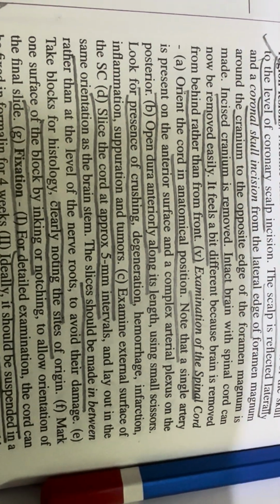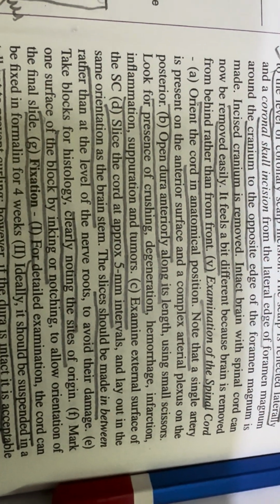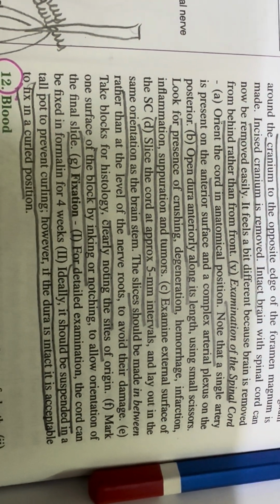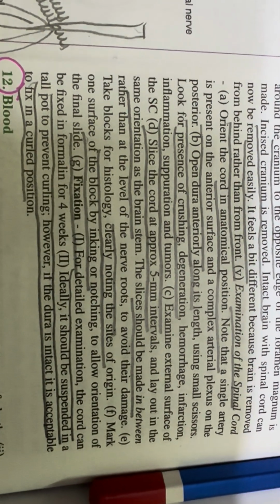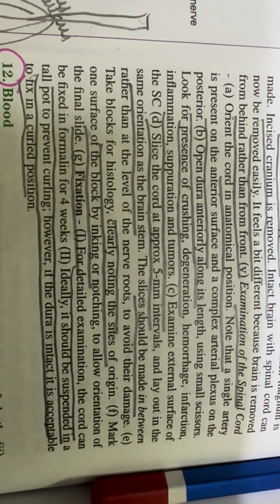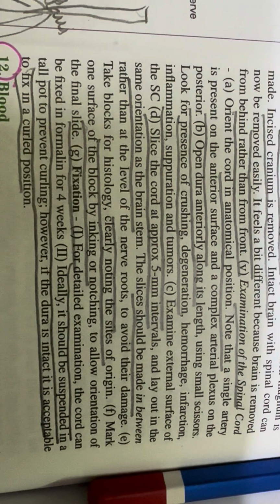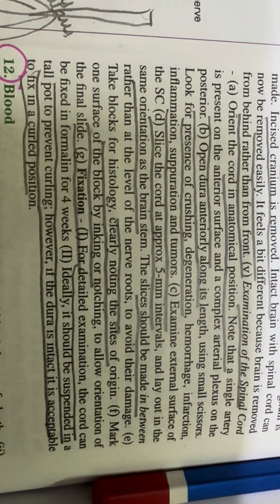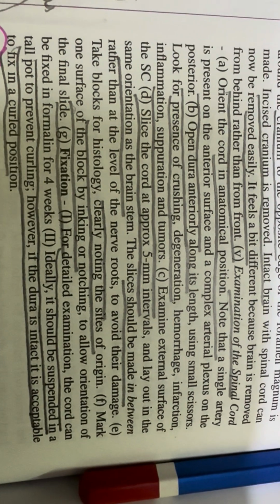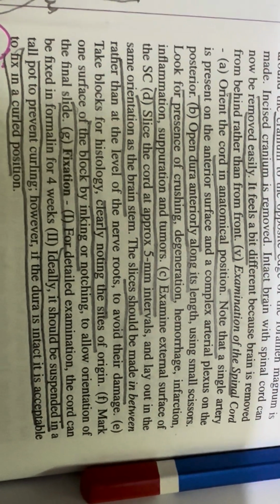Examination of the spinal cord. Orient the cord in anatomical position. Note that a single artery is present on the anterior surface and a complex arterial plexus on the posterior. Open the dura anteriorly along its length using small scissors. Look for presence of crushing, degeneration, hemorrhage, infarction, inflammation, suppuration, and tumor. Examine the external surface of the spinal cord.